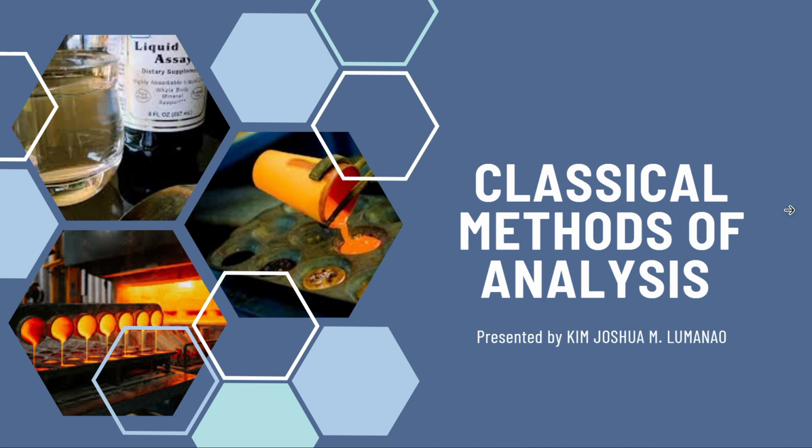They rely on wet chemistry, gravimetry, and titrimetry to determine the concentration of a certain metal. In this presentation, we will cover copper assay, zinc assay, lead assay, and iron assay. First, I will explain the classical method of analyzing copper in ores and samples, also known as the copper assay. This process determines how much copper is present in a given sample.